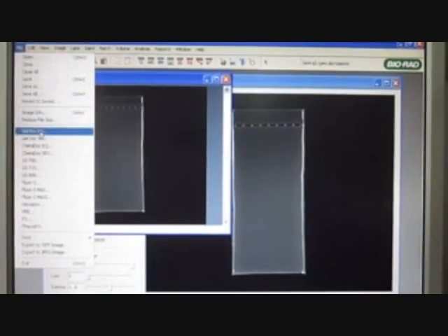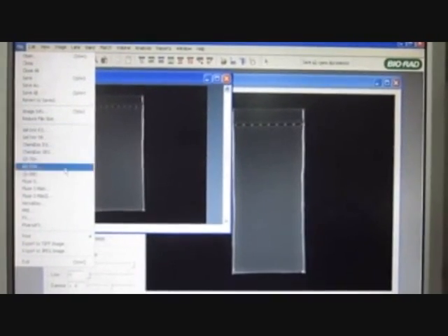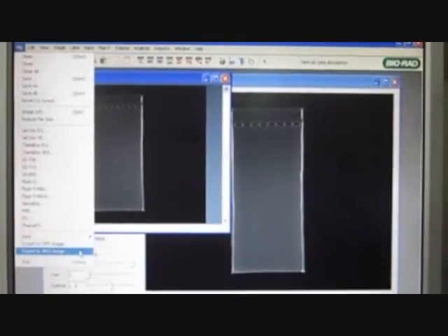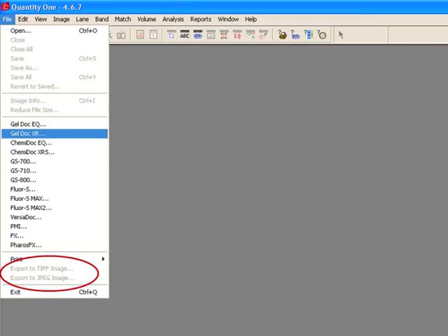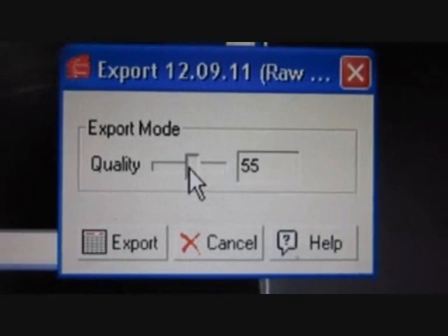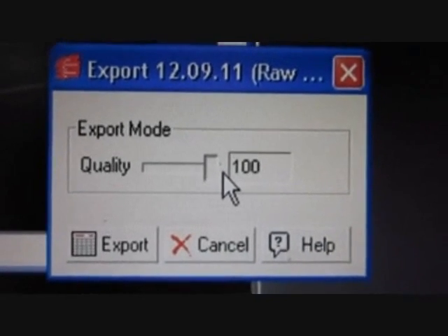Once the image has been saved, this image has to be exported to JPEG file format. Select Export option from the File menu. In this, select Highest quality export and export the image.